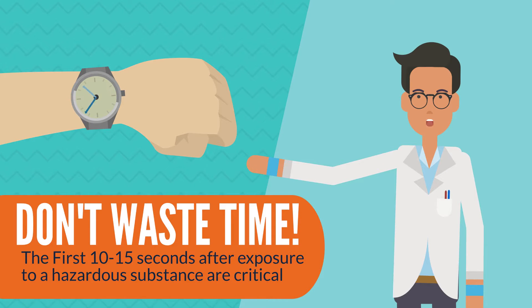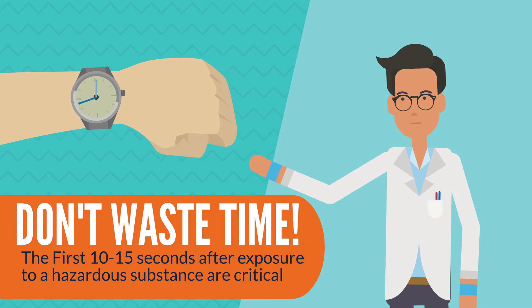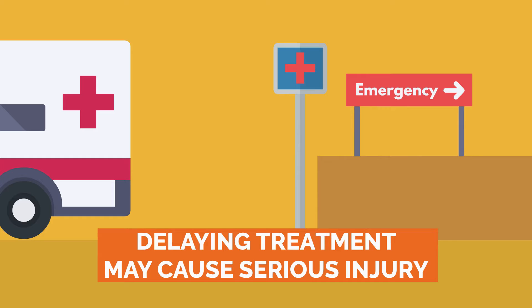The first 10 to 15 seconds after exposure to a hazardous substance, especially a corrosive substance, are critical. Delaying treatment, even for a few seconds, may cause serious injury.